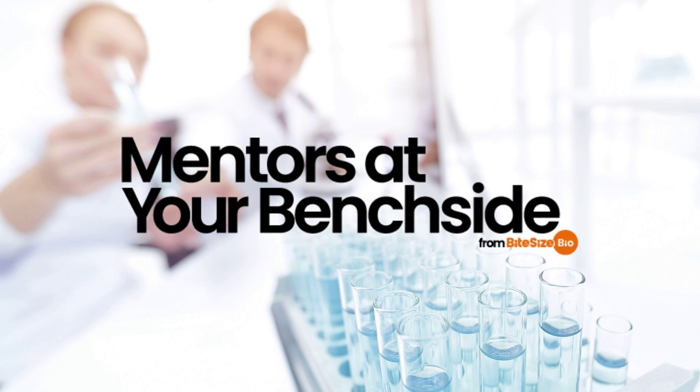Ethanol has a number of uses in microbiology. It's used in the purification and precipitation of biomolecules, in staining and restaining specimens in histology, in dehydrating tissues before embedding, and in disinfection. There are three grades of ethanol commonly used in the lab that are suited to these purposes. What are they? 95% ethanol. This is the highest concentration of ethanol you can get by distillation alone, because 95.6% ethanol is an azeotrope. This means the vapor state has the same ethanol to water ratio as the liquid state.